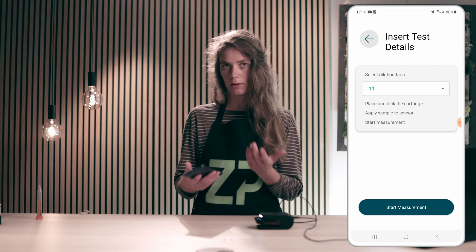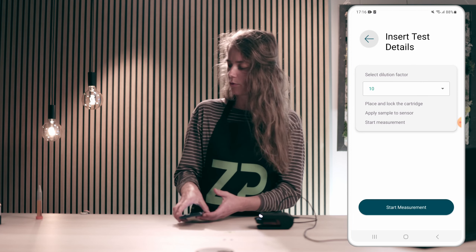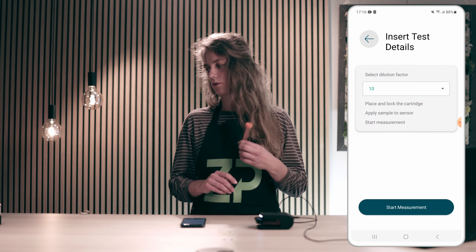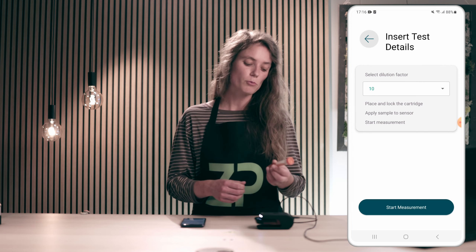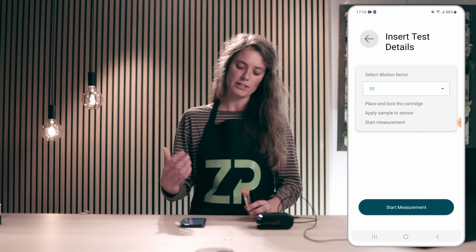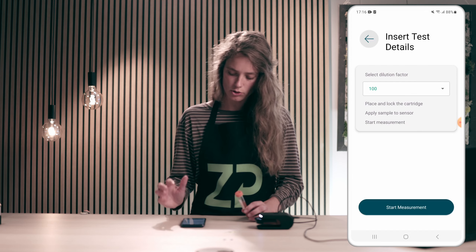Now the app will tell me exactly what to do to run the measurements. I will run a sample that I've already prepared, which is a habanero powder dissolved in buffer. To be exact, it's 0.1 grams of habanero powder in 10 milliliters of buffer, which provides a dilution factor of 100. So I will change the dilution factor to 100.